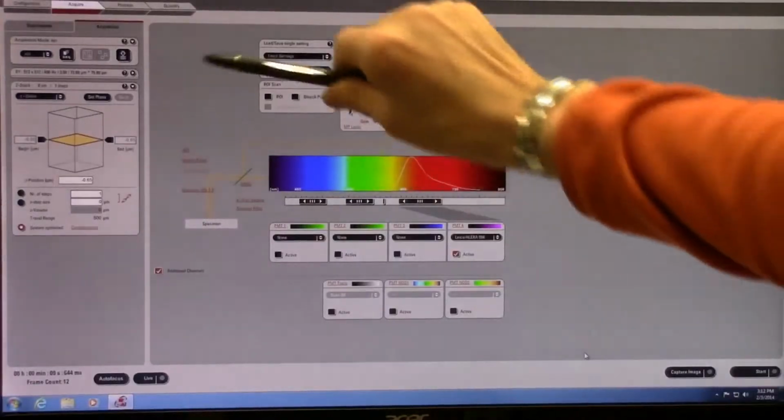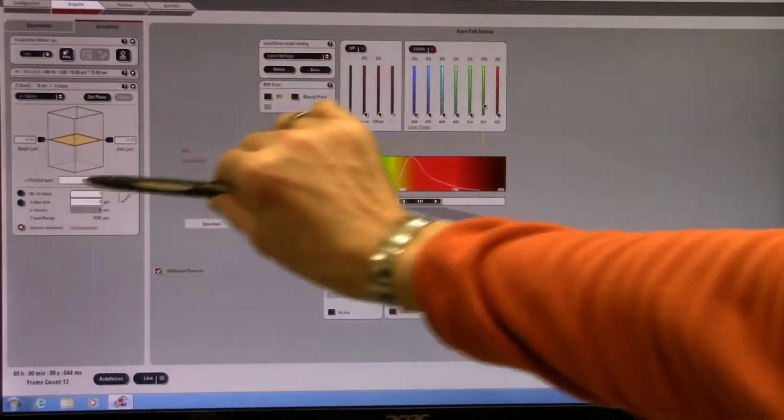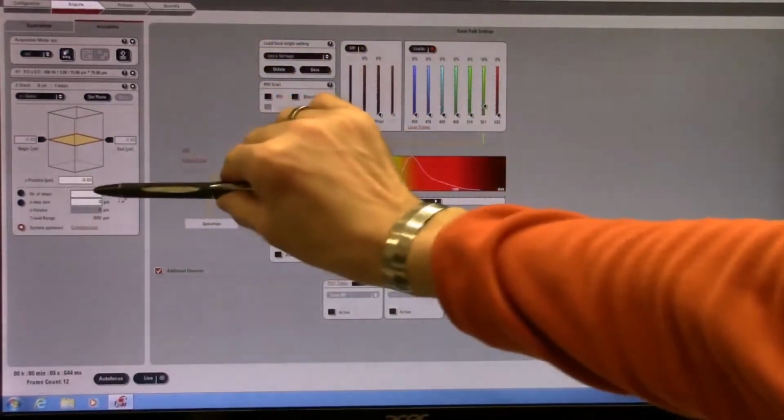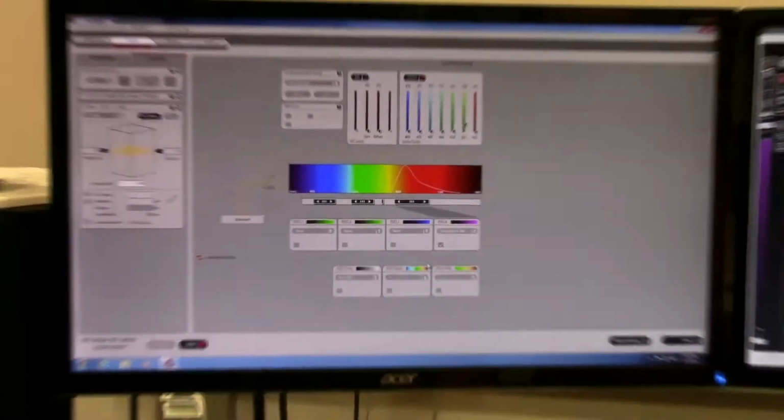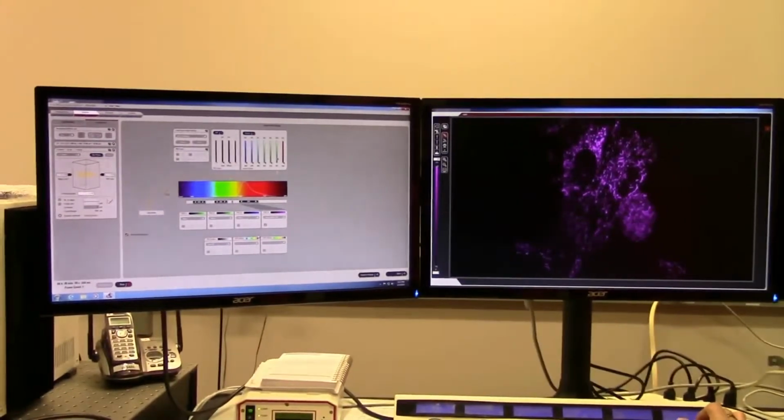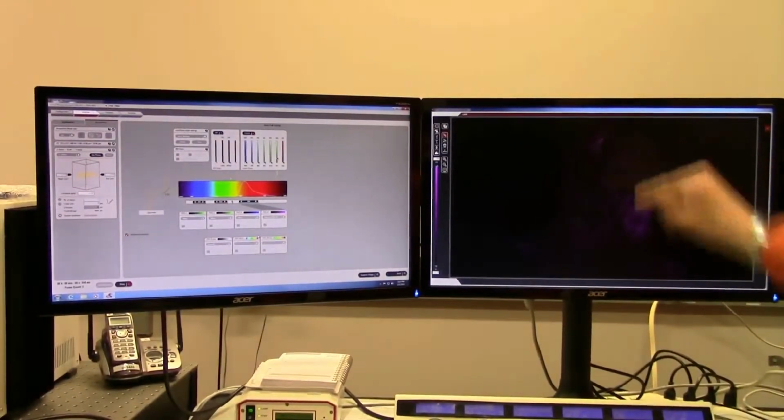In order to achieve our Z stack with this visual representation of the confocal volume, we're going to need to set our top and bottom levels. So our focal point at the top of our object and at the bottom of our object, and then we're going to scan in between those two objects to generate our Z stack. And the way that's done is by using the live scan feature and adjusting the Z position back until we're just at the top of our image.